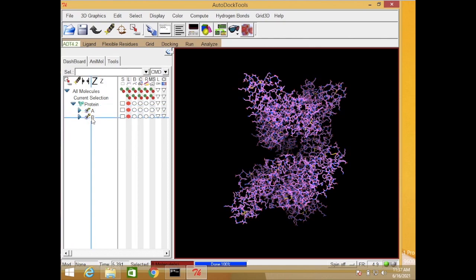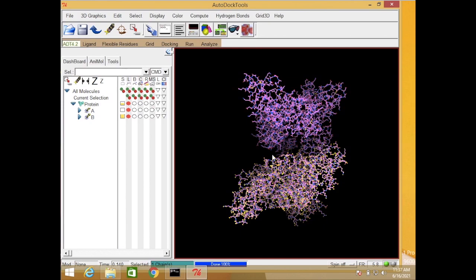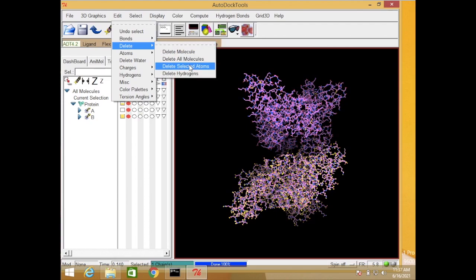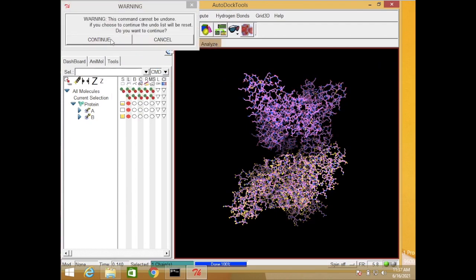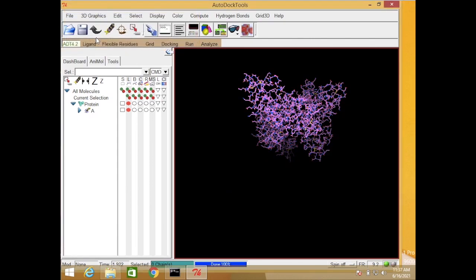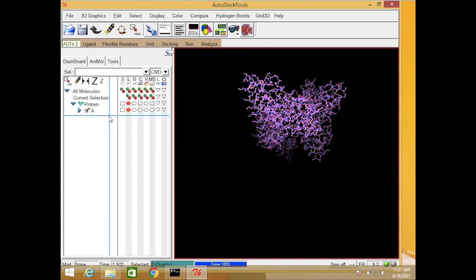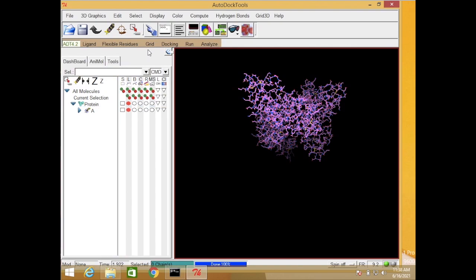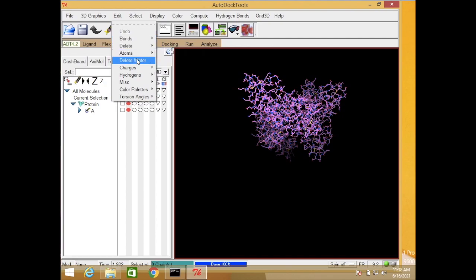I do not need chain B so I need to remove it. Just select it here, then go to Edit and delete the selected item. It will delete chain B because chain A and chain B are actually homologs, so we only need chain A here.